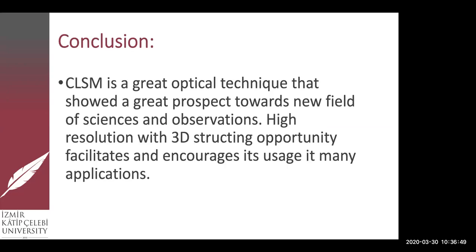As a conclusion, confocal laser scanning microscopy is a great optical technique that opened the door to some new fields in sciences. The high resolution and the 3D structuring opportunity facilitated and encouraged its usage in many different applications, not only in medical fields, but also in material sciences to check how a material is structured in a 3D way.